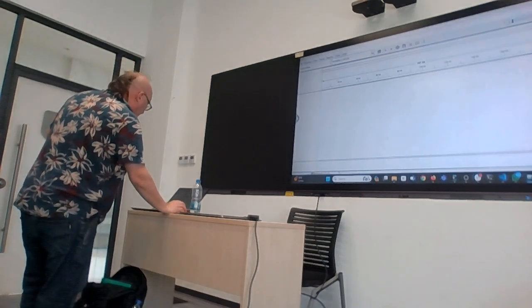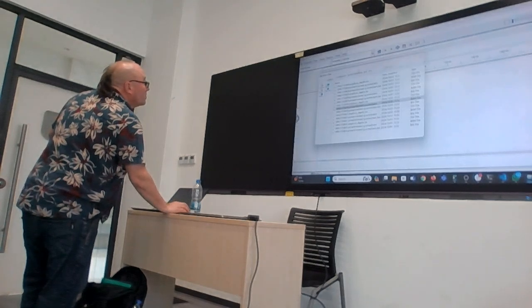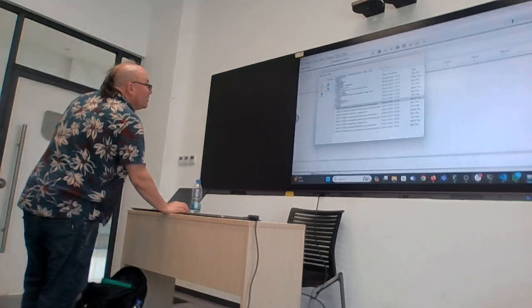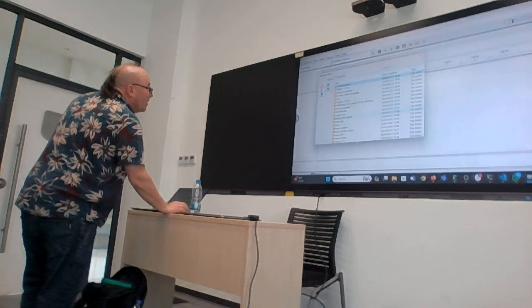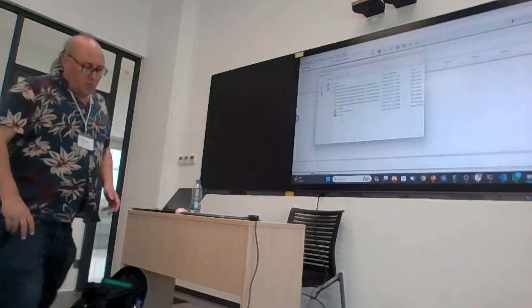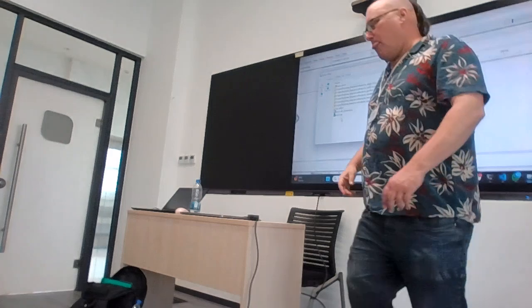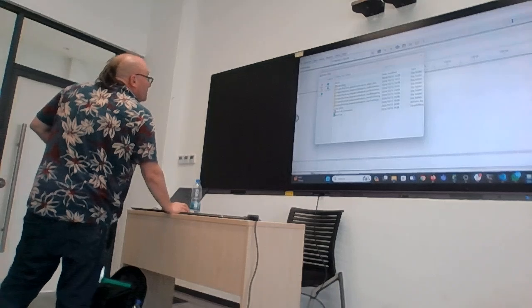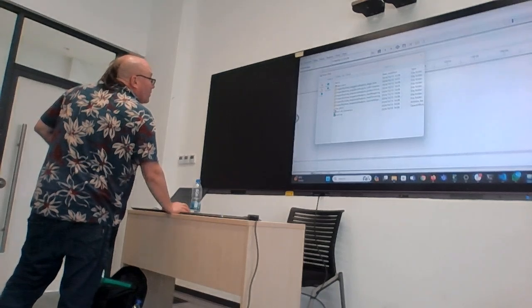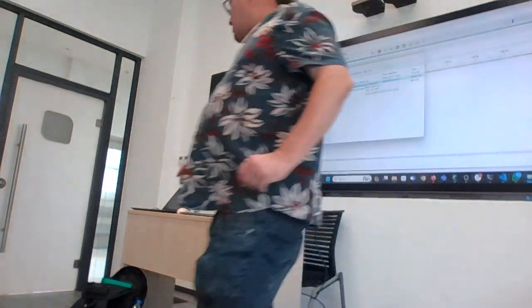It opens the window on my other screen, so I'm just going to fix this window. Look in documents, mpox1 output, and now I'm looking for the folder called align trim. You're going to need this IGV tool, but I'll show you just now how to install it. So what have I got in the align trim folder?